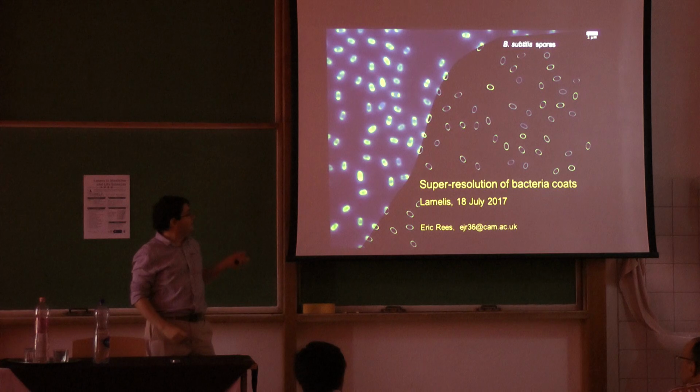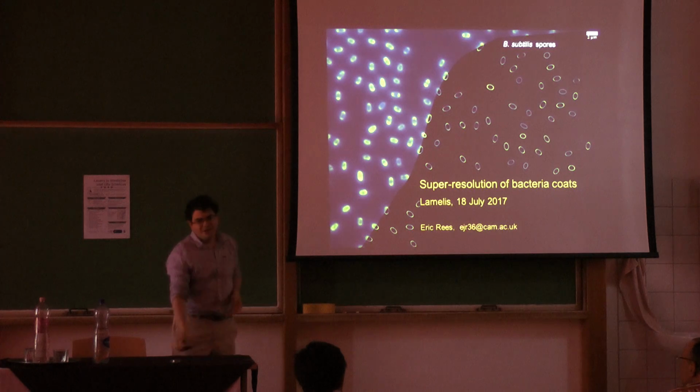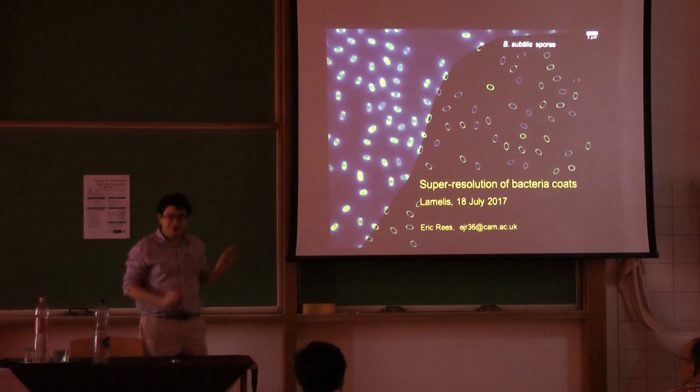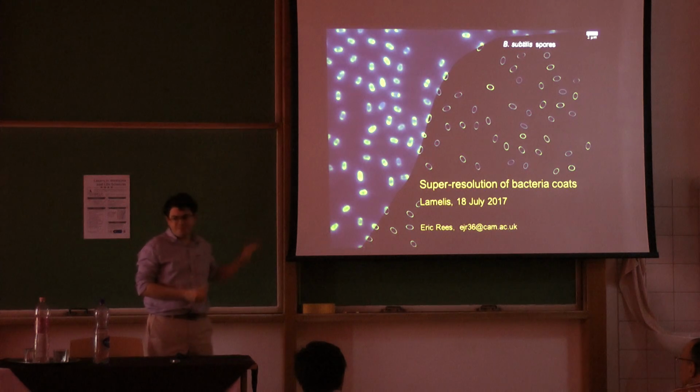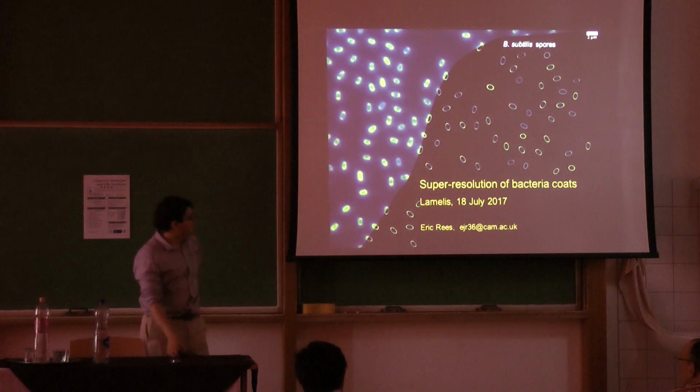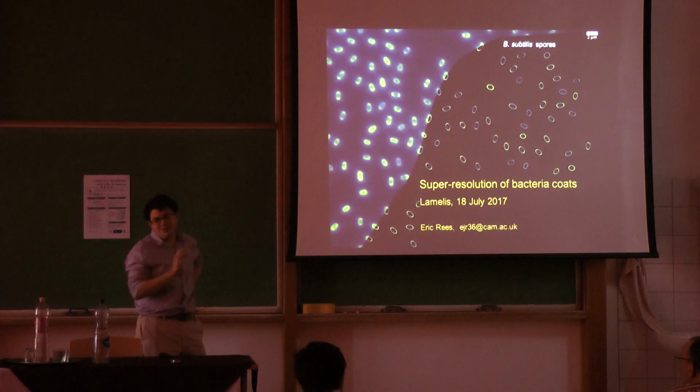our techniques. And so more recently, a friend, a colleague of mine who was a microbiologist asked, can we use one of your boss's expensive super resolution microscopes to measure the shape of some bacteria that he's interested in for the purpose of studying antibiotic resistance? And I said, yes, we can. We can use an expensive super resolution microscope to look at your samples.